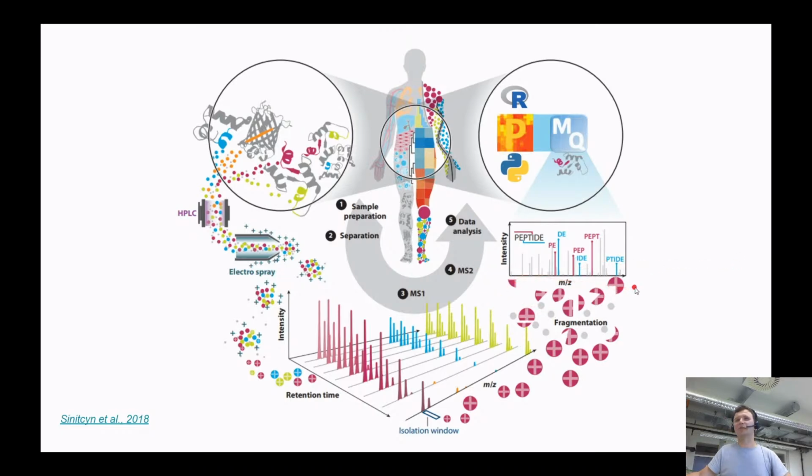We are getting all possible fragments. If you think about this, it should be all possible suffixes and all possible prefixes of the initial peptide. Because when a breakage happens, we have two pieces: this piece is called the prefix, this is called the suffix. We should somehow see these fragments. After fragmentation, we take all these fragments and throw them into the mass spectrometry mass analyzer.